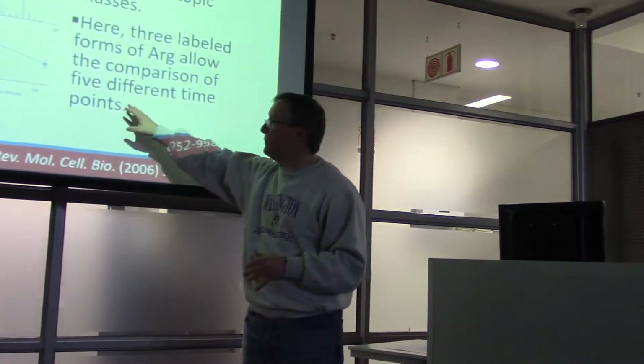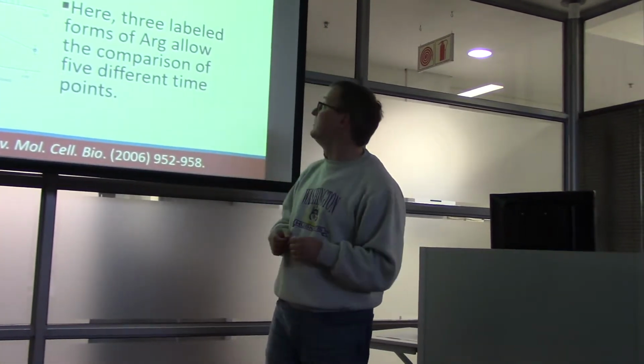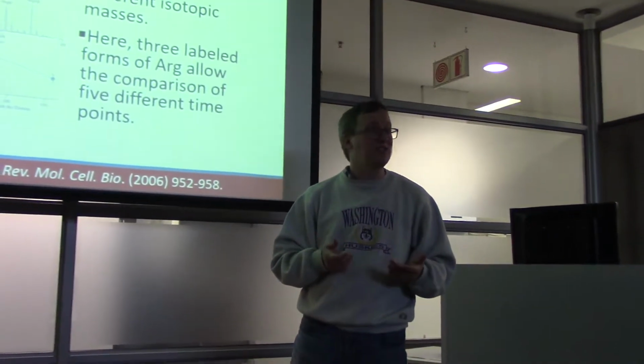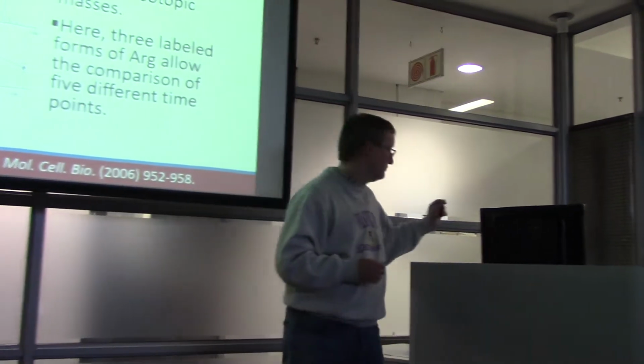So SILAC is very powerful for doing techniques like this, and gets used when people have access to this sort of thing. In South Africa, it's a little harder to get access to heavy labeled elements, but it is feasible.